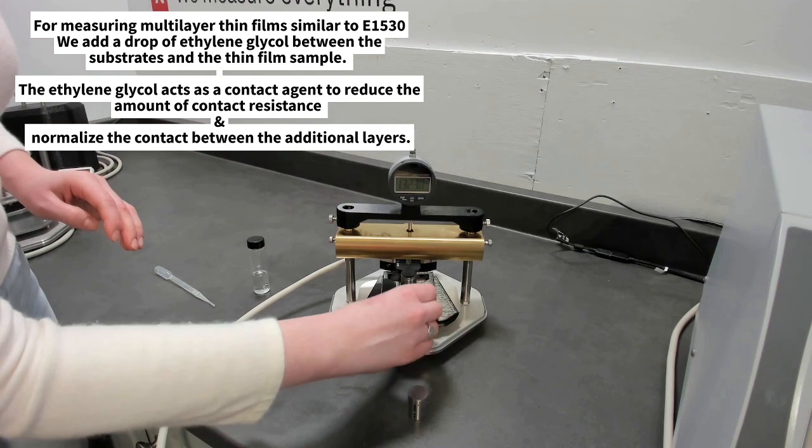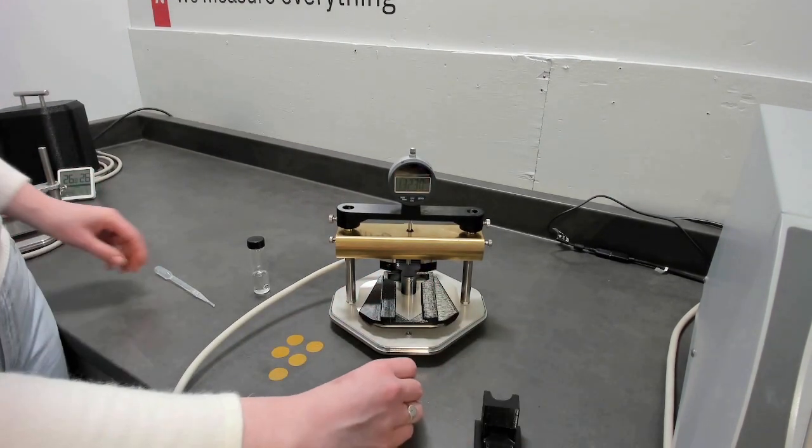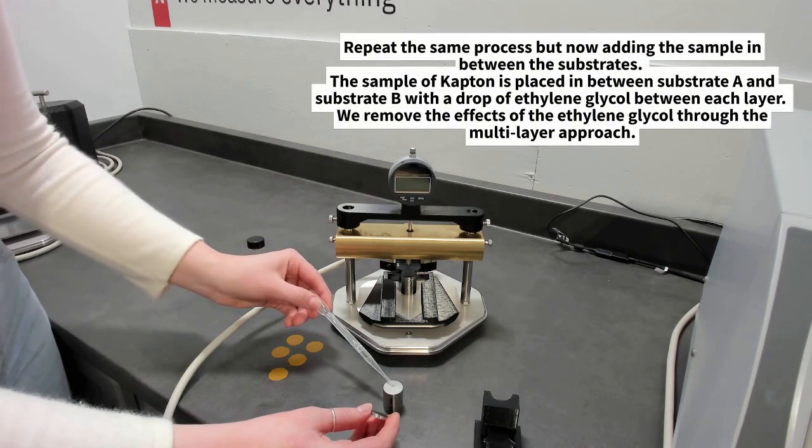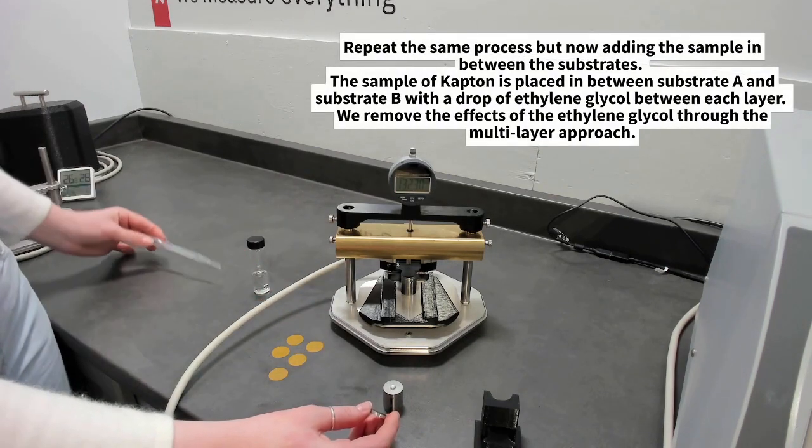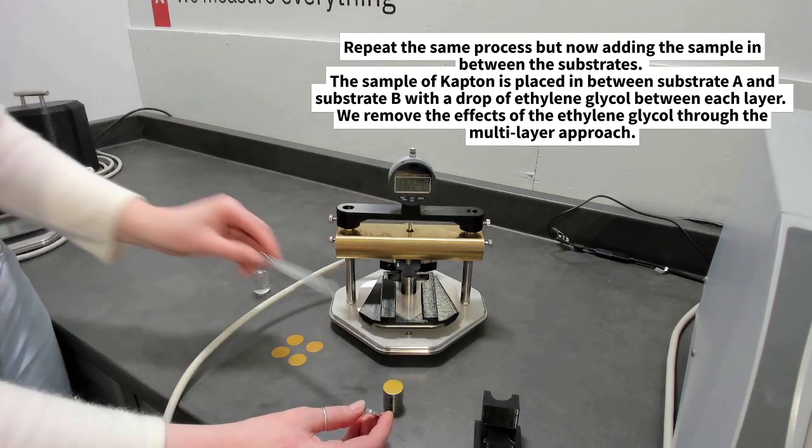Repeating the process by adding one layer of thin film, in this case it's a Kapton, to the bottom. We're measuring these symmetrically so it's a mirror of what's on the bottom on top. One drop of ethylene glycol.